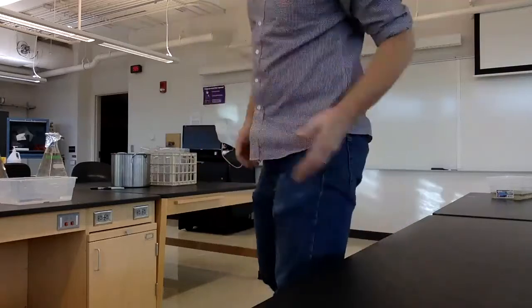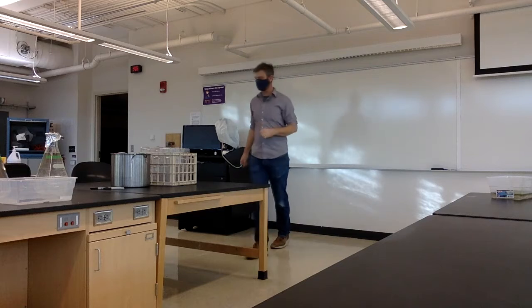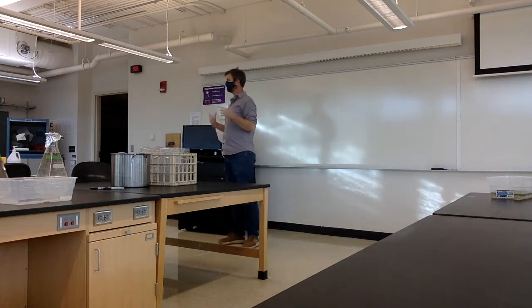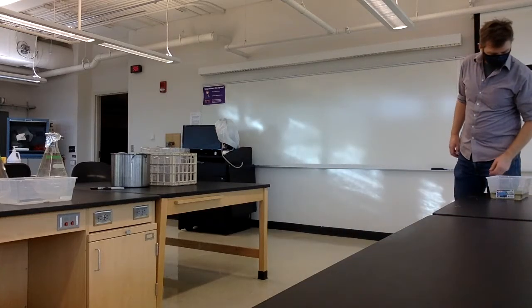Hello, this is the recorded version of lab today. Maybe it won't be the best recording, but you get some of the experience of being here live. All right, so we had that one lab class where we talked about experimenting, and I thought it'd be nice to get some practice, set up an experiment, and hopefully it works out okay. If the experiment doesn't work okay, at least we'll learn something about some plants.